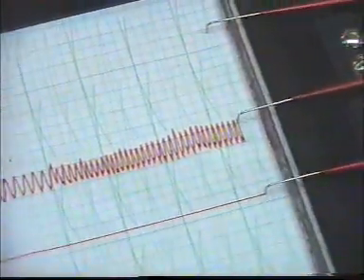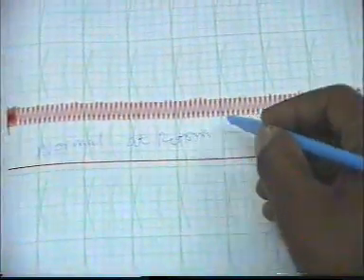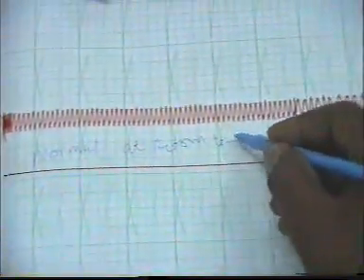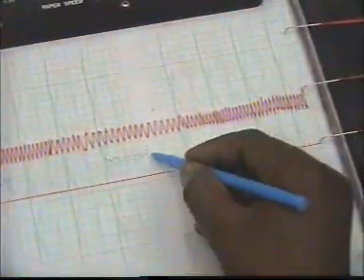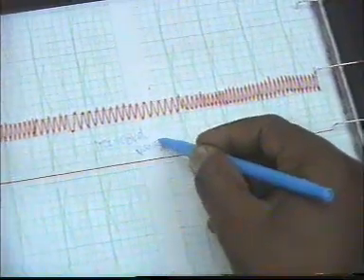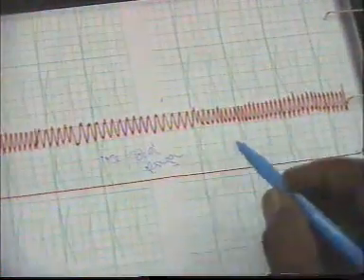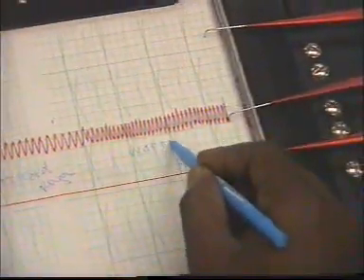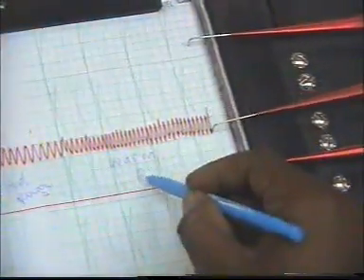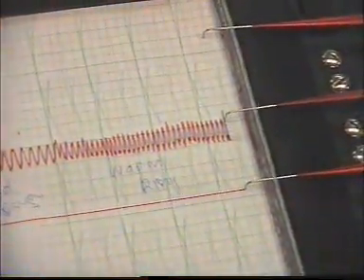Okay. At room temperature, then we add ice cold ringer. The heart slows down. Then again we add warm ringer, and again the heart rate increases.